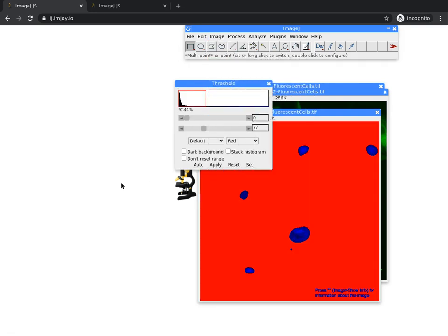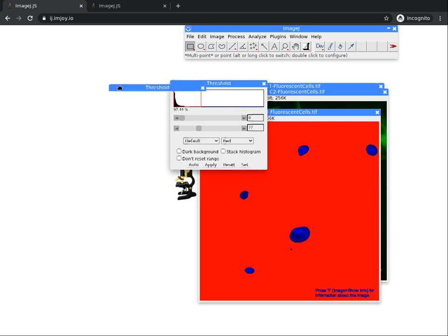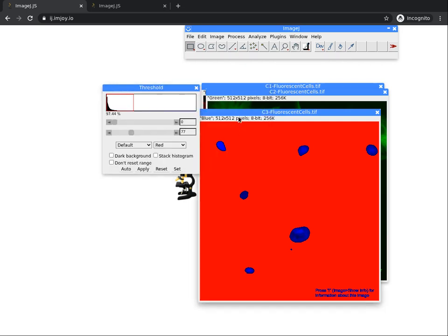You have to be sure that you have selected the right image to analyze before you do this process. So here I selected the blue, so you will see my image getting red. The software highlights in red all the objects that it has been selected. So here for now, it's only the background of my image. Here the color red is simply an aid to better identify the selected object and visually see them, and does not correspond to anything in particular for the analysis. So do not worry even if you're analyzing a green channel, for example.